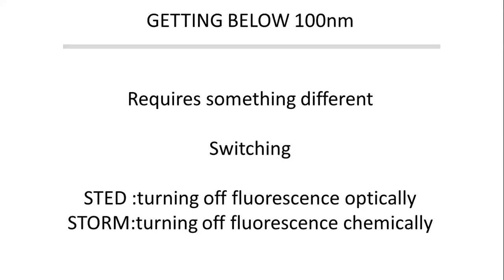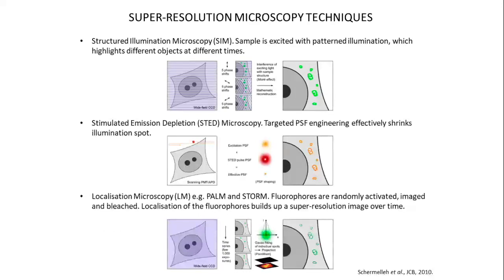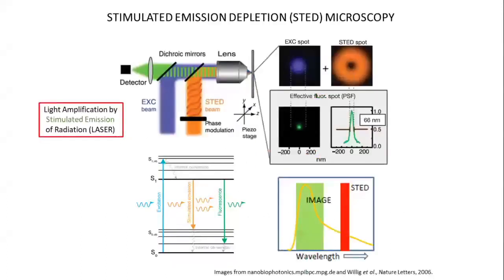So let's just concentrate on STED for a minute. This is how it works. The STED microscope starts off as a regular confocal microscope. That blue beam, let's say, is the excitation beam. In a regular confocal microscope, it might be hitting GFP or something like that. Green fluorescence comes out onto the detector and it's raster scanned over the sample in some manner. In this diagram, they're actually moving the sample around, but we basically focus down to a spot. That blue dot up the top there is our excitation spot. So that's a diffraction limited spot, of the order of lambda over 2NA in diameter.